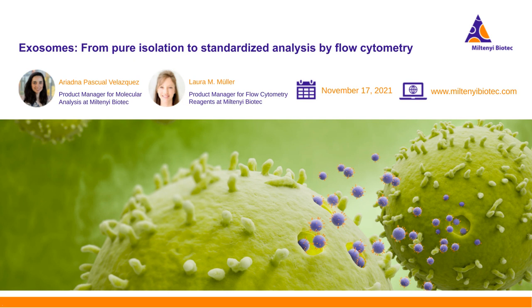I think I can answer this question. Our isolation microbeads, so far, we only have products that rely on the tetraspanin expression, CD9, CD81, CD63. But we do not have at the moment other microbeads for exosome isolation. However, we have in the portfolio many other microbeads that could potentially be used for exosome isolation, or at least tested for other markers.